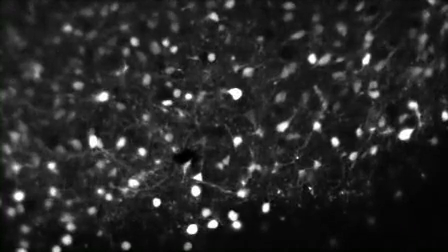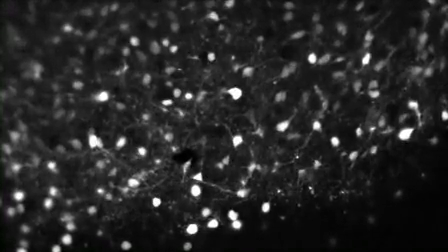Changes in cellular fluorescence across multiple cells can then be analysed to read out the activity of the developing cortical network.